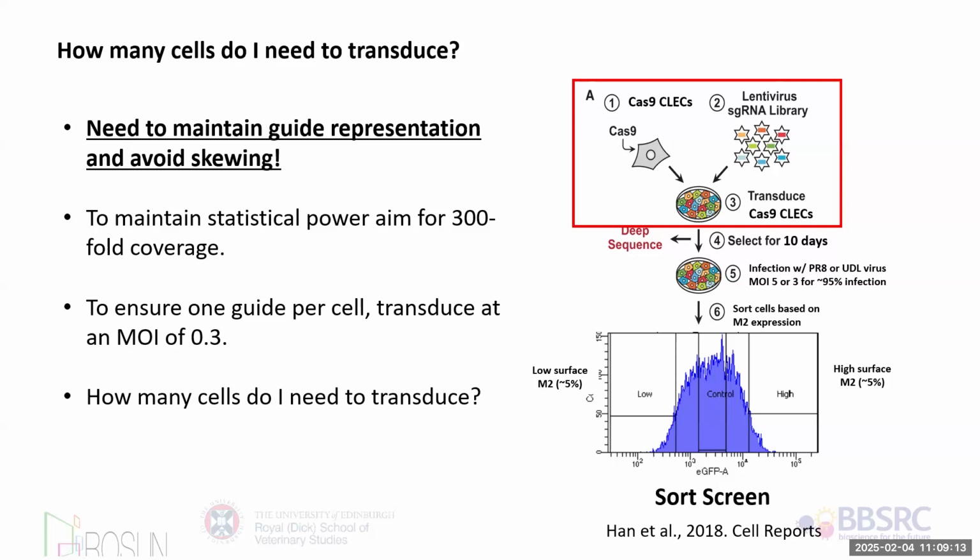Then essentially you've got to adjust that. So we were talking about the guys trying to do the salmon stuff. Because of the multiple alleles created by the genome duplications, you have to have much bigger libraries. If you have a bigger library, it means you've got to transduce more cells.